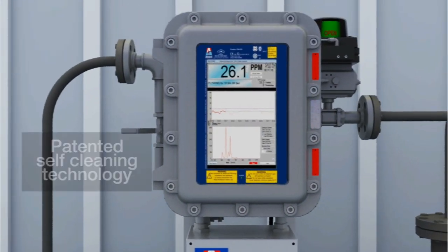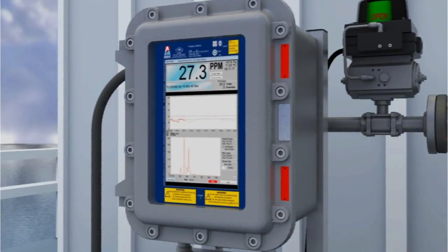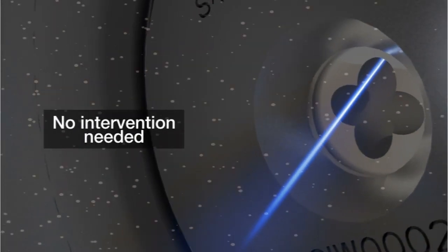Once installed and utilizing Advanced Sensor's patented self-cleaning technology, the analyzer ensures that the measurements reported are accurate and reliable, with no intervention needed.